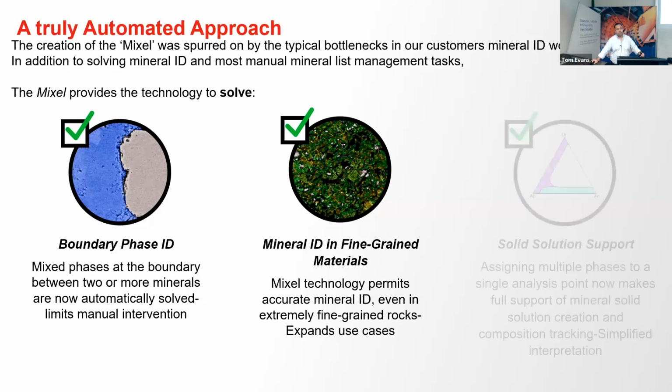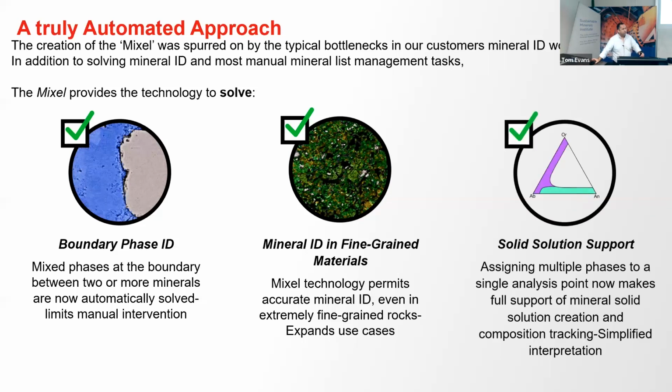And in these types of rocks and very fine grained textures, it gets amplified due to the nature of our samples. And the third aspect that we really wanted to improve is the fact that minerals form solid solutions. They have, of course, a chemical formula and a structure, but they don't have a unique chemistry.